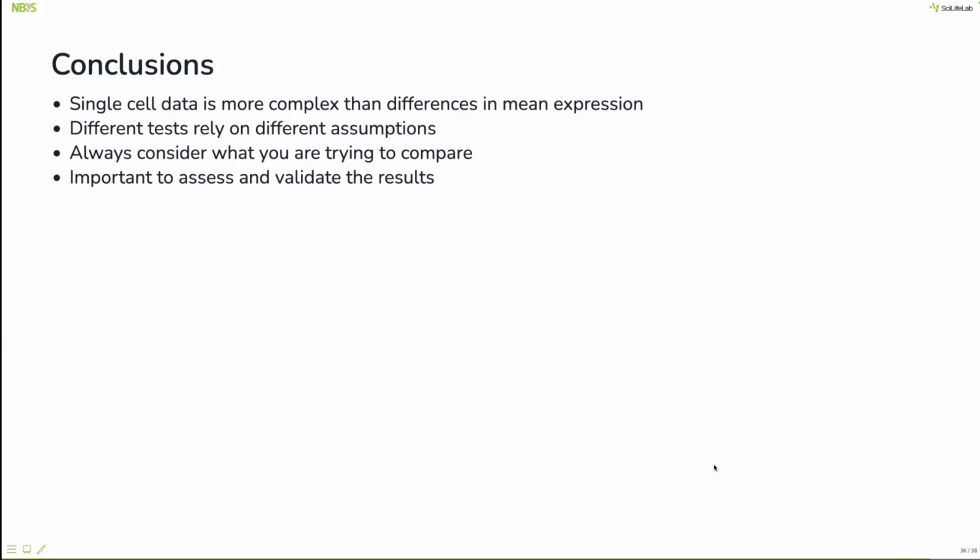One way to do it is if you can split up even more and have more batches. It sounds counterintuitive, but then you can at least get an idea of how strong the batch effects might be. And if your experimental groups are comparable between your batches, say between batch 2 and 4, then perhaps you can expect the difference between 3 and 4 to be smaller as well. Åsa, do you have any input?